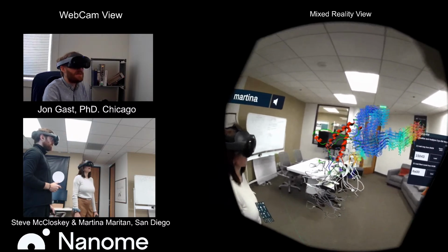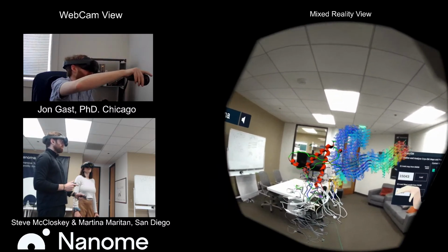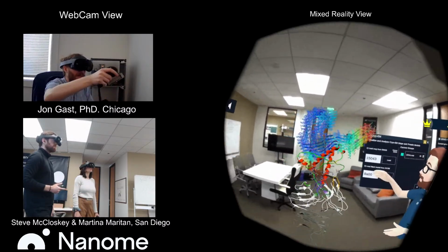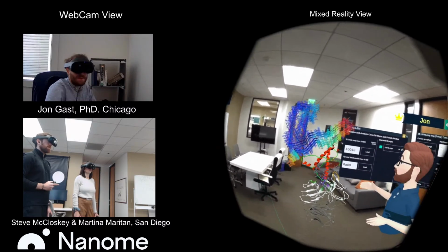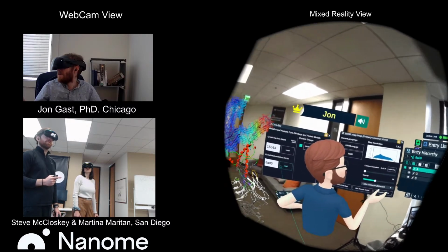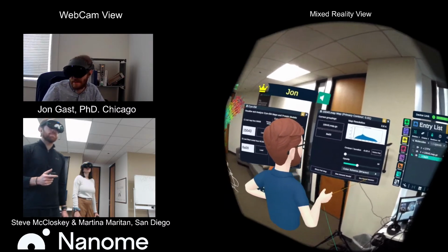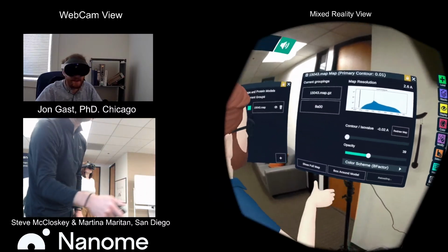Absolutely. And let's take a look at a single one of these proteins here that's stacked and do a little side by side comparison. So what we're just going to do is deselect what we have here in the fibril, and I'm actually going to come into here. And first I'm going to pick one of our three. And now we're going to use the last feature inside the cryo-EM, we're going to box around the selection instead.